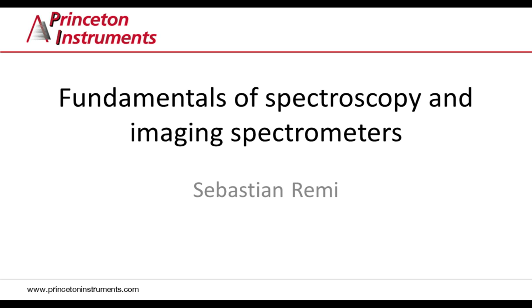In the first part of the webinar, I will give a light discussion of what spectroscopy is and why we do spectroscopy. Spectroscopy is a very wide and extensive field, but it's nevertheless useful to understand why we do it, what knowledge we gain from doing spectroscopy, as well as what information we gain from observing spectra. And I will present a few practical examples.